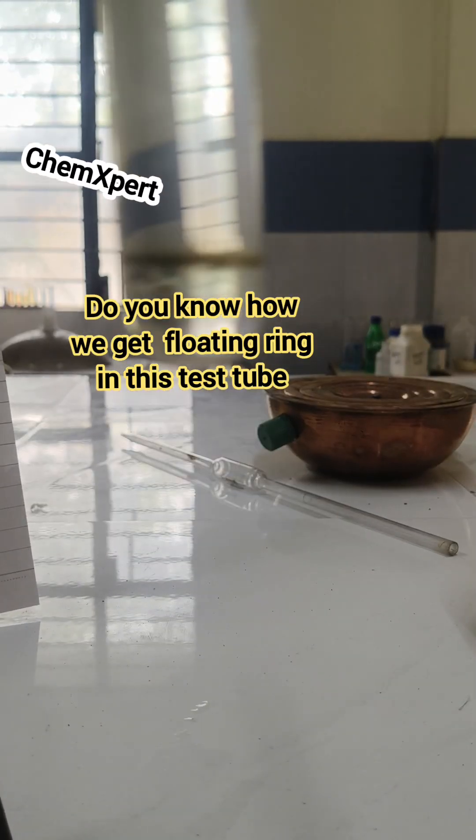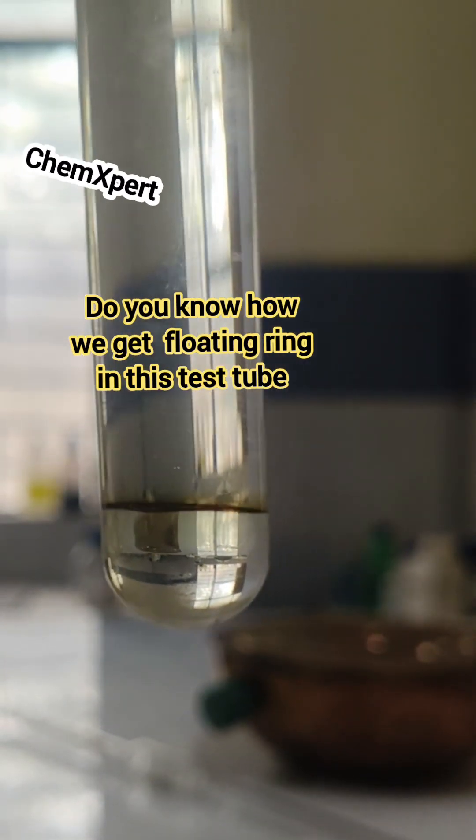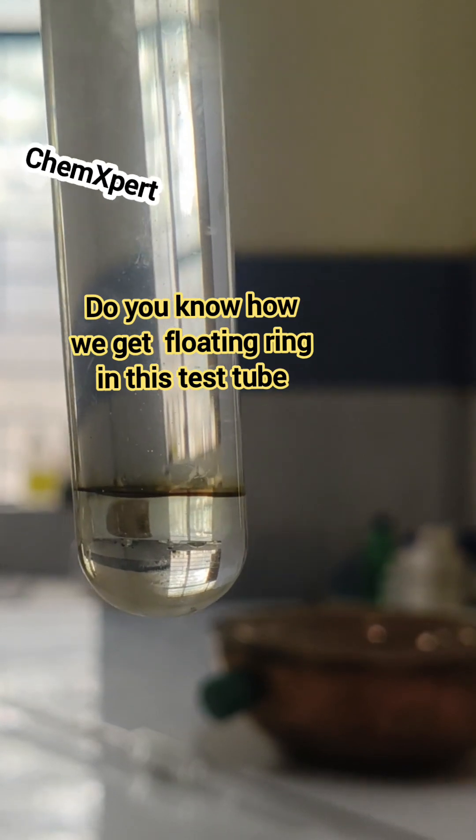Do you know how we get a floating ring in this test tube? You can observe here a black color ring which floats in this.